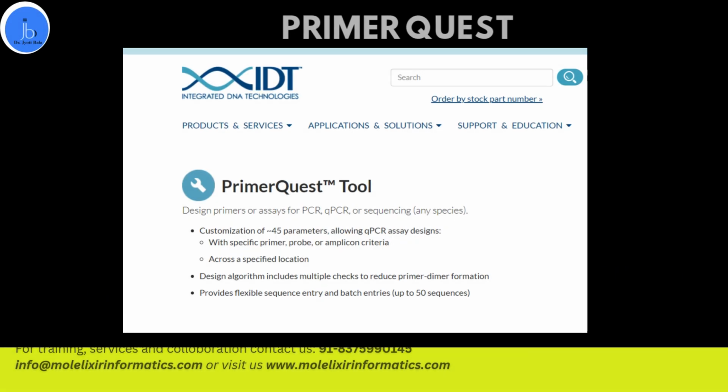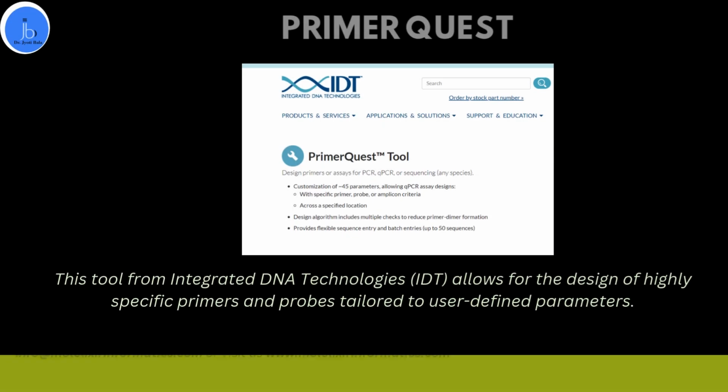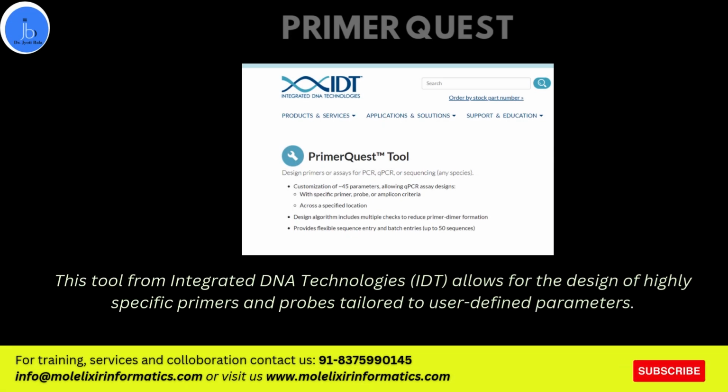Adding on to the list, the next one is PrimerQuest. This helps in custom design of primers and probes for PCR. This tool from Integrated DNA Technologies allows for design of highly specific primers and probes tailored to user-defined parameters. It is particularly useful for quantitative qPCR applications.